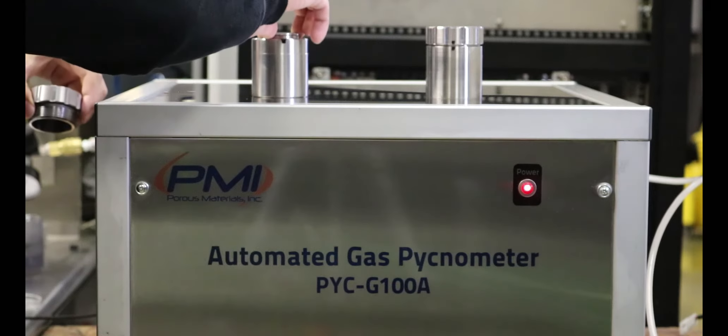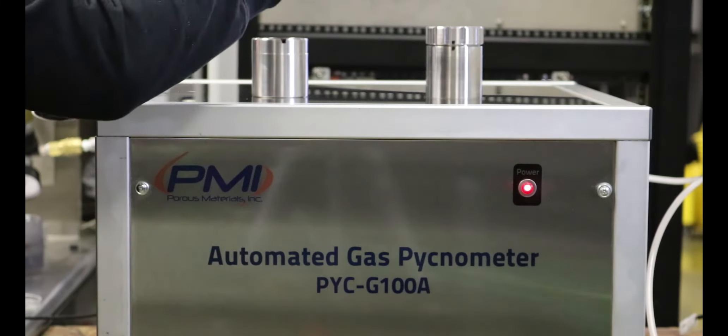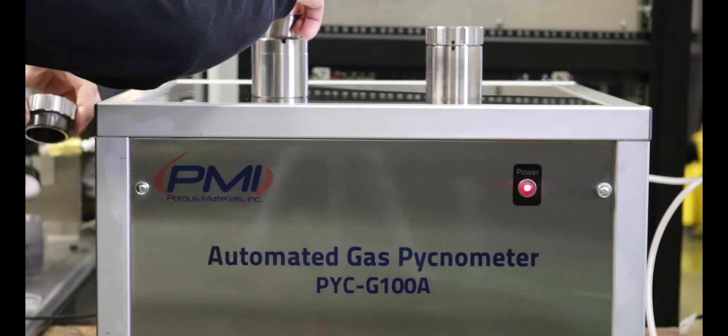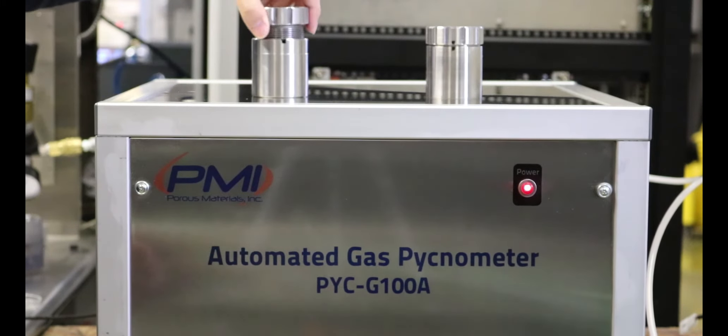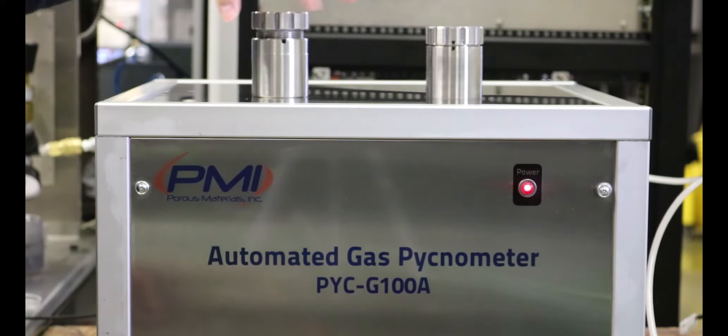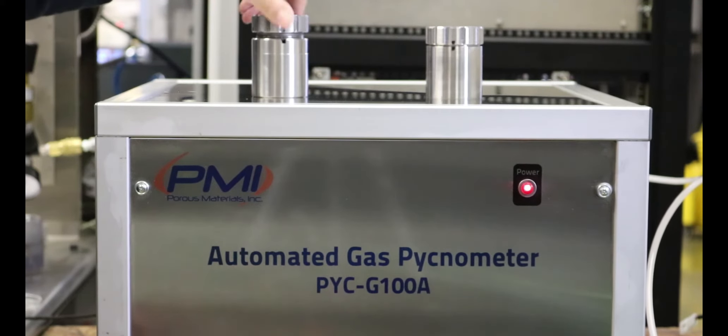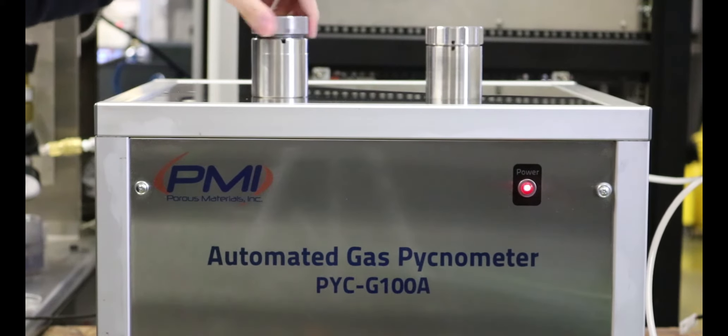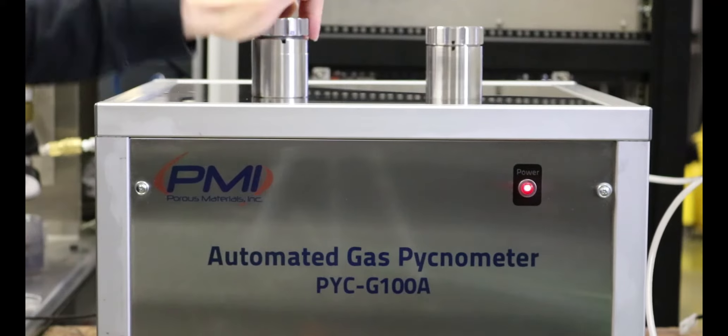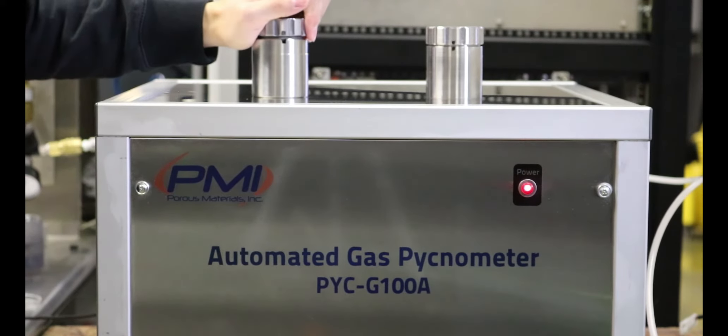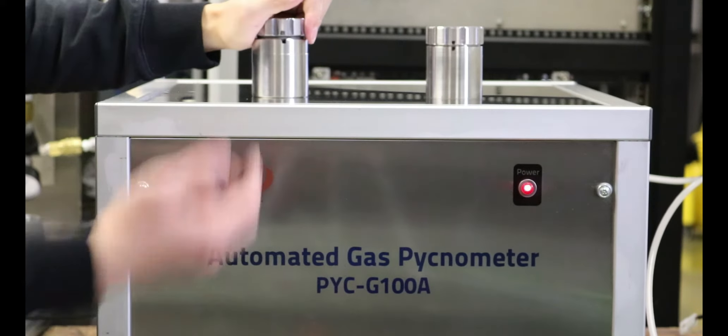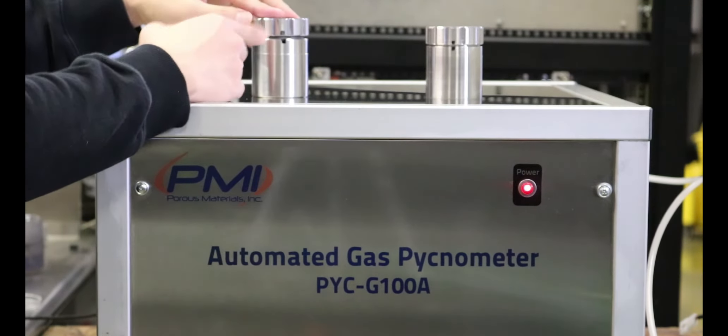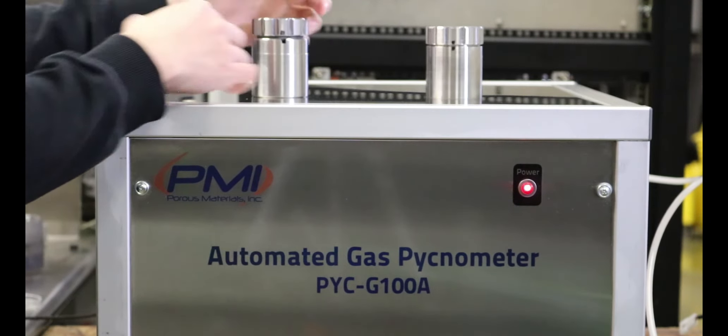Once calibration is complete, the user may begin measuring samples with the PYCG100A. The procedure is essentially the same as with the calibration sequence. Open the desired sample chamber and insert the sample to be tested.